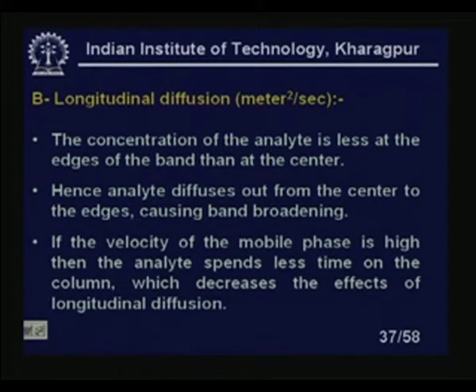If the velocity of the mobile phase is high, then the analyte spends less time on the column, which decreases the effects of longitudinal diffusion, right.